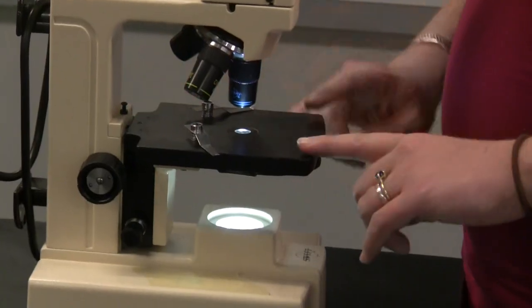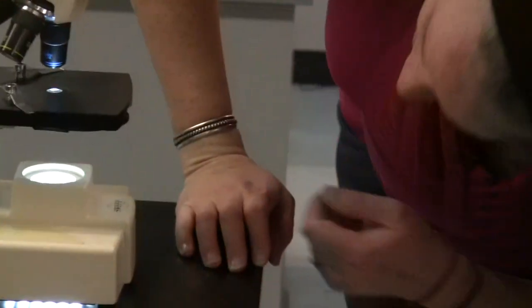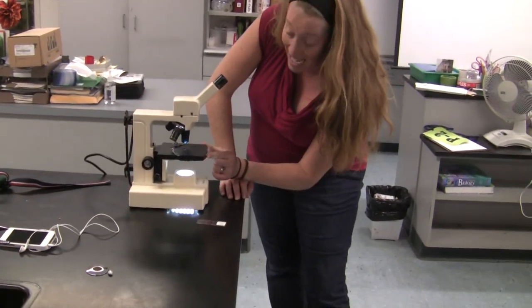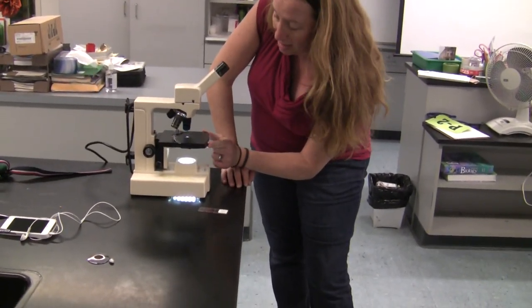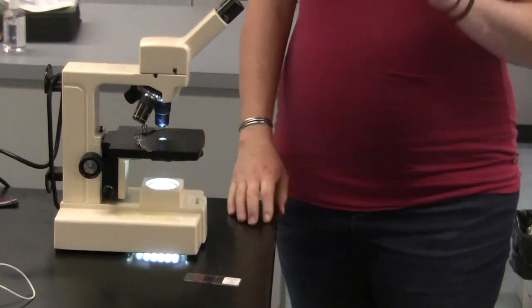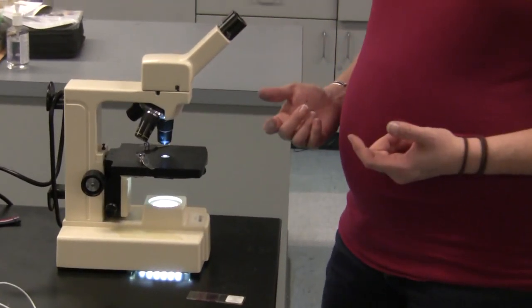Once you have it as far down as it can, you want to look under and there are little holes in the thing that's called the diaphragm. So you want to click the diaphragm over and make sure that you have the most light possible shining up through the stage.